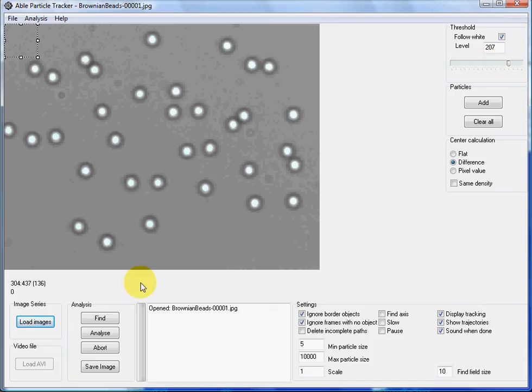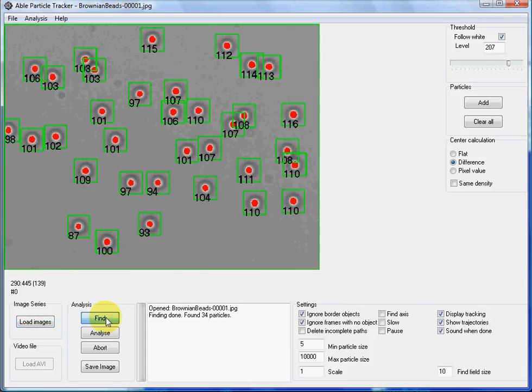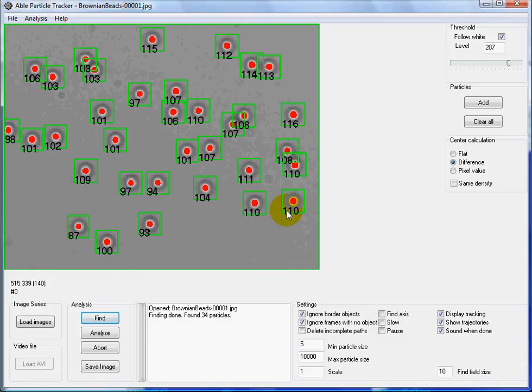Now we have to press find button. The program marks the initial positions of all particles.